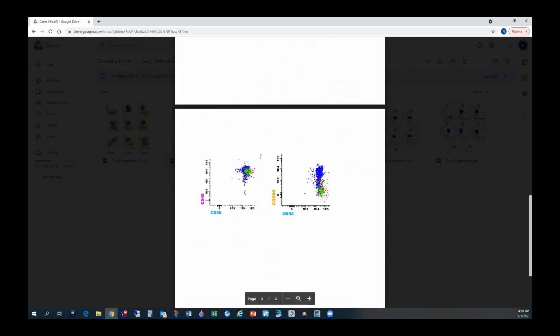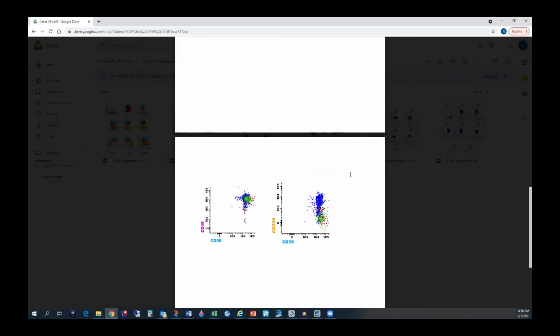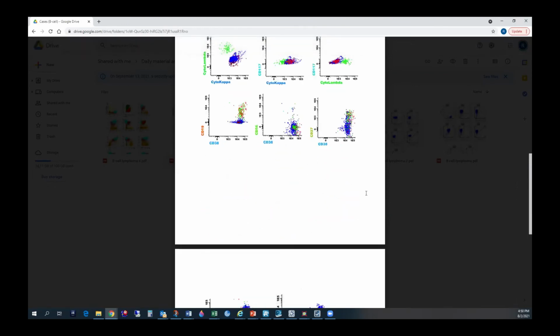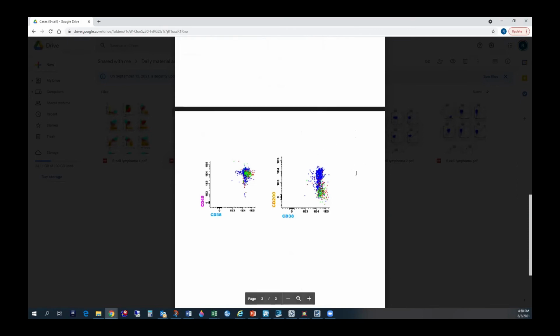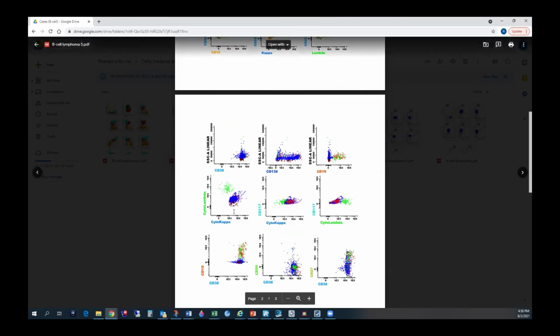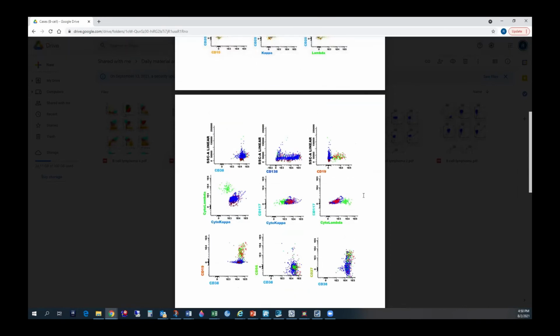And our abnormal plasma cells usually lose 45, but here they still have good 45. So that is something unusual, but it's still fine. They have other aberrant markers to help us. Abnormal plasma cells express 200, like in this case, and your normal plasma cells do not have 200. So far, we see the aberrancy is that they have lost 19, they have lost 27, and they have expression of 200. Okay, so we have a population of kappa restricted aberrant plasma cells. That is one side.